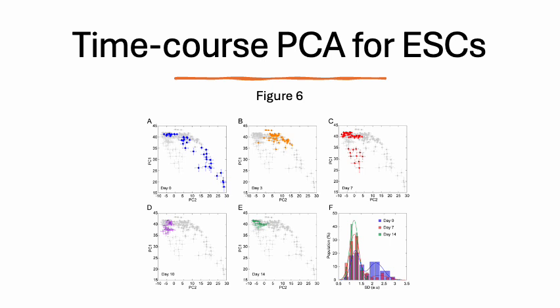First of all, at day 0, the cell population is highly diverse. In the PCA score plot, the data points are widely scattered, which shows that even in a state considered undifferentiated, individual cells are not at all the same. Some may already be slightly different from others, perhaps in a way that means they're already leaning towards particular development paths.